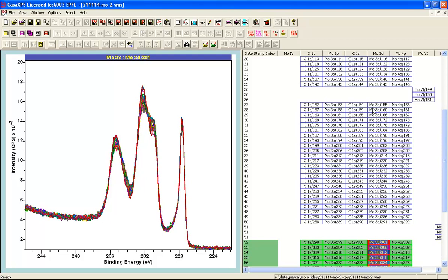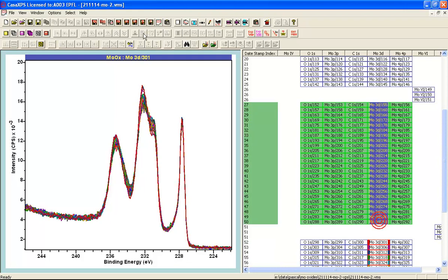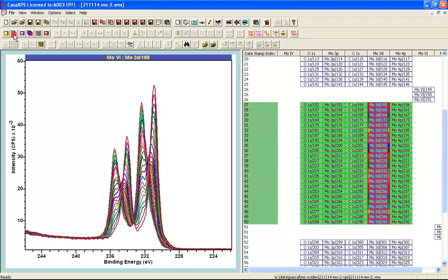That the spectra that correspond to the 6+, when I overlay these, instead of looking well behaved as the other two data sets did, these do not. So what I'd like to do is try to understand what has happened in the case of the measurement of the molybdenum 6+ and why it differs from the case of the 4+ and the molybdenum oxide.